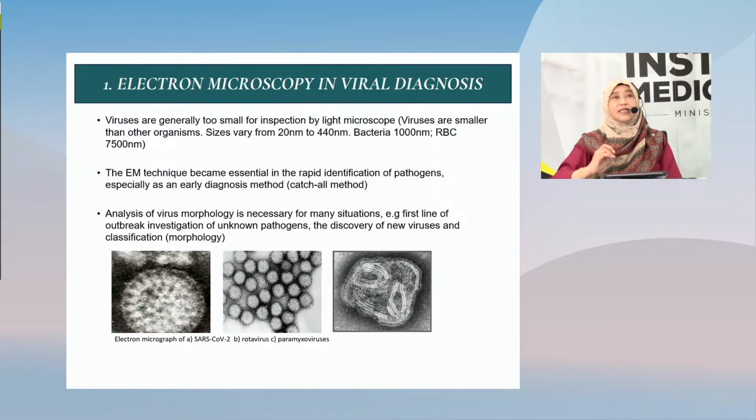Okay, electron microscopic technology is widely used in viral diagnosis and viral research, because viruses are generally too small for inspection by light microscope.